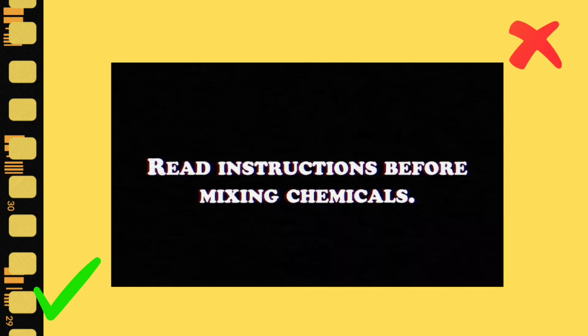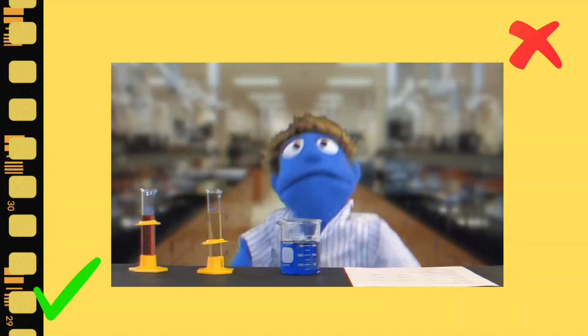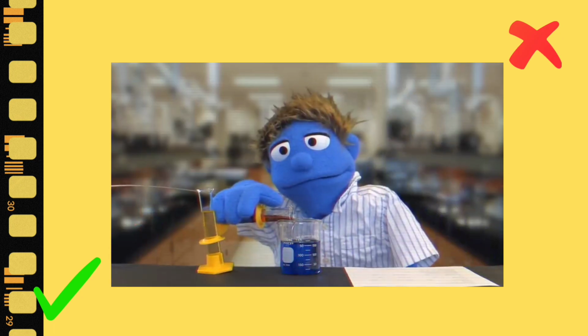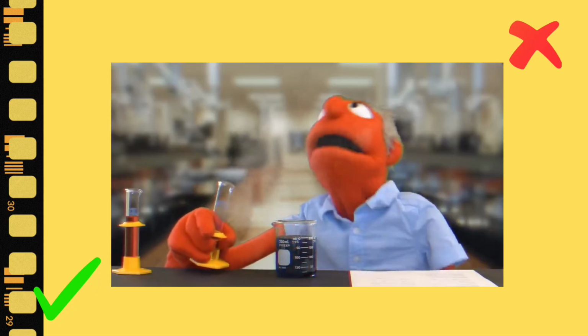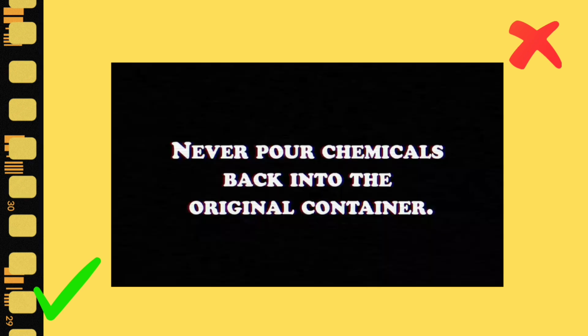Don't take off safety goggles. Read instructions before mixing chemicals. Don't randomly mix chemicals. Never pour chemicals back into the original container.